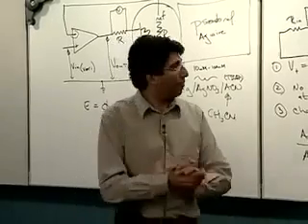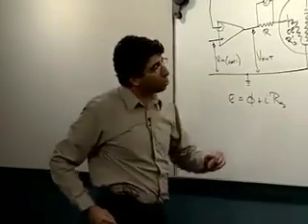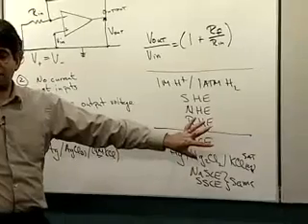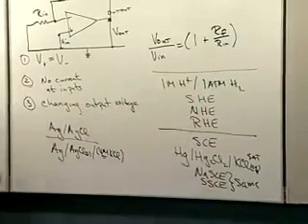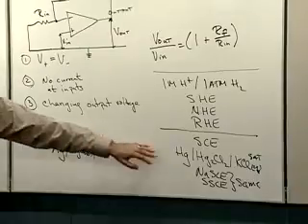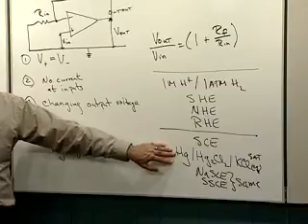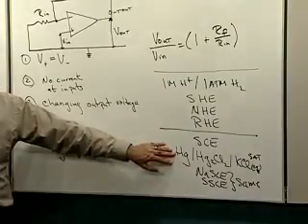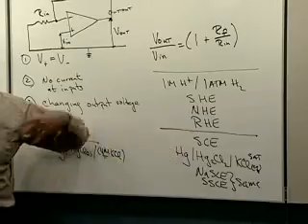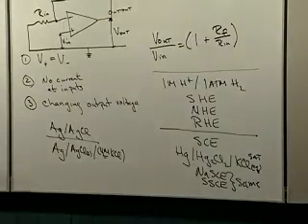So now we have our potentiostat, we have our electrodes. One other comment I do have to make. When you go out and you buy a reference electrode or a reference electrode body, you have the option to buy a variety of different junctions there. The most common one is a ceramic frit, which typically has a leak rate of 5 microliters per day. That's before you start banging it around. When you take it out of the box, very, very low leak rate, high impedance, but enough ions through it.